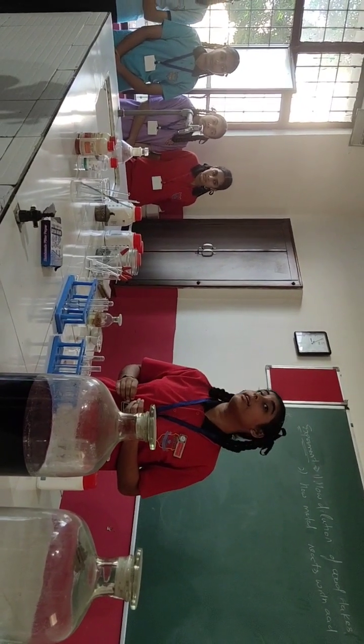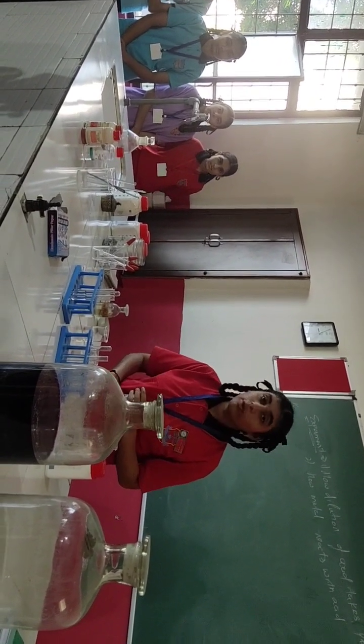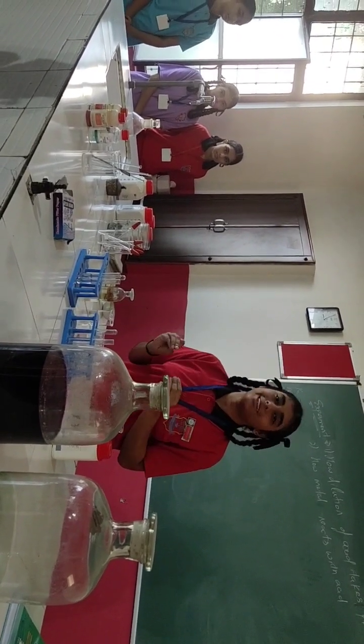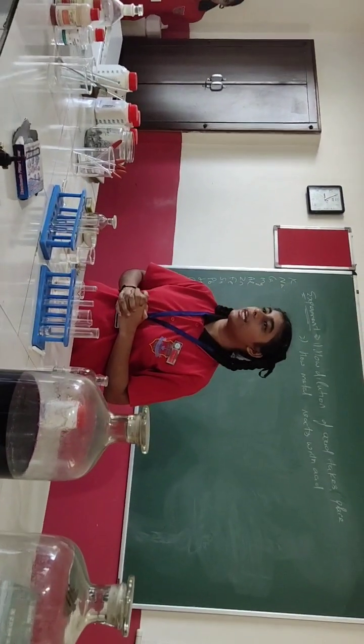But how can you detect that hydrogen gas is produced? There is one specific answer for that. If you bring a lit matchstick near the dilute HCl solution and it produces a pop sound, then you can recognize that yes, hydrogen gas is present there.